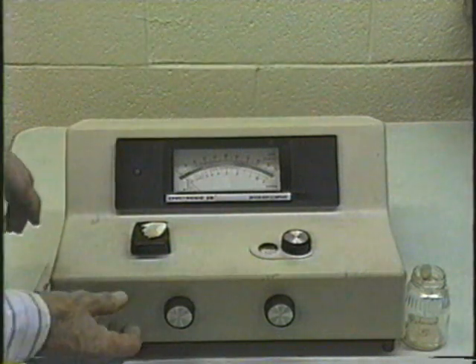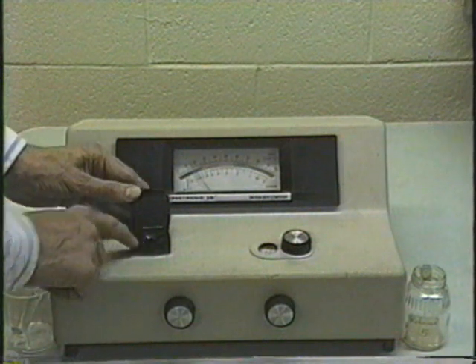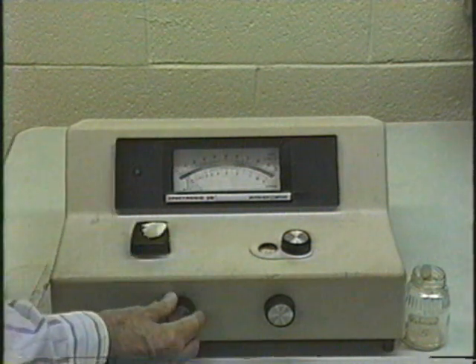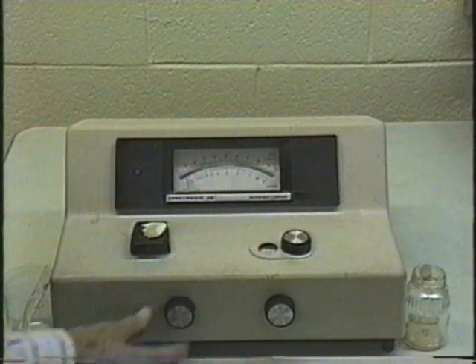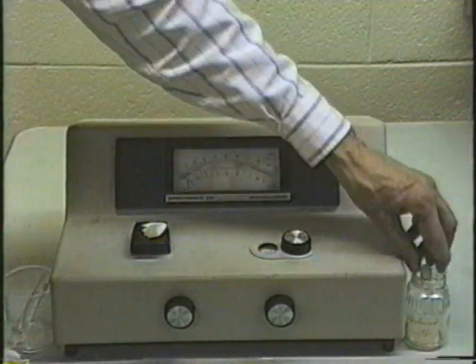So, to do that, this is the sample compartment, and it's empty at this time. Make sure you close it because if you open it, you can get stray light coming in. So it's closed. And then adjust the needle so that it goes exactly to 0%. Now the 0% is adjusted.